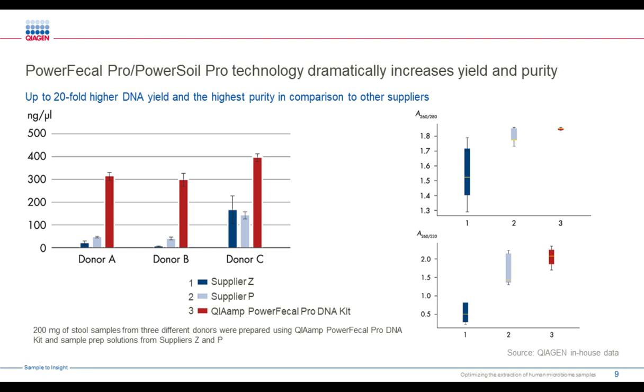This is a test that we did to see whether or not we could find interesting differences between stool samples from old or young individuals. And what we found was that as a general tendency, now this is a limited sample size, and of course it's not a population study or anything, but we did find generally that stool from older individuals was more difficult to lyse, had a higher level of inhibitors, and saw a greater improvement with our new chemistry than stool from younger individuals, which generally tended to perform fairly well in almost most methods that we looked at.